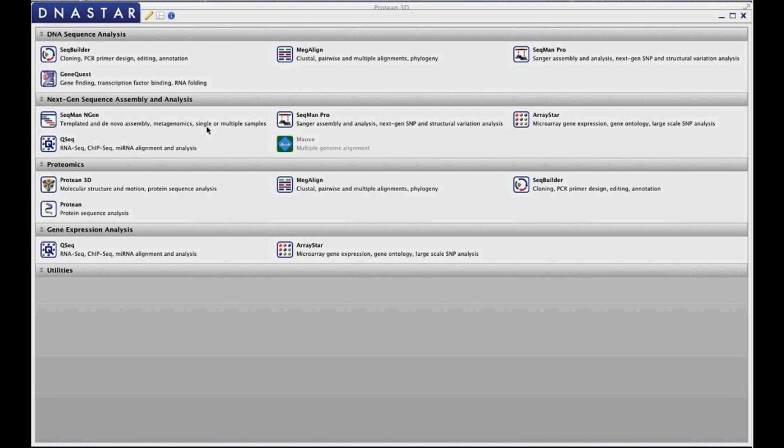First off, I want to start by showing you our Star Navigator, which is a handy tool to determine which application provided by Star would fit your needs the best. So for instance, when working with proteins, you would want to look at the proteomics section, which provides 4 different applications to work with proteins. You can use just the simple explanations here to determine what application you might be interested in, or you can also hover over any of them.